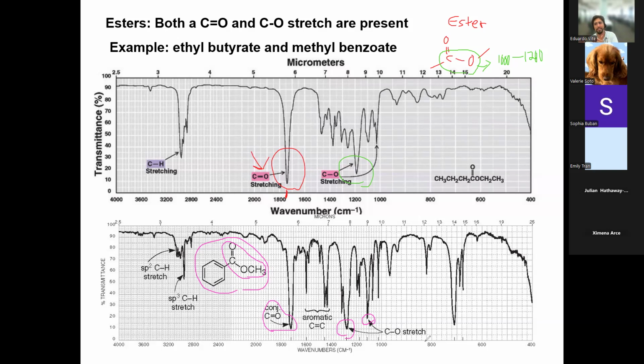Sometimes they all behave similarly, just like you can have loops, you can have whorls, you can have double loops in your fingerprints, but it's still a unique spectra. So just know the general principles, know the general regions. Sometimes there are going to be variations. Okay. And again, what about the rest? Well, here in the green, well, I already used green. Let me use another color.